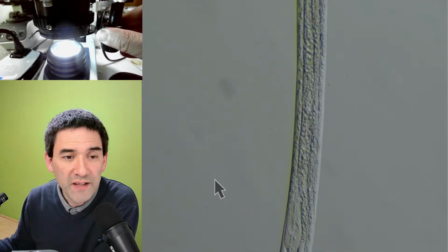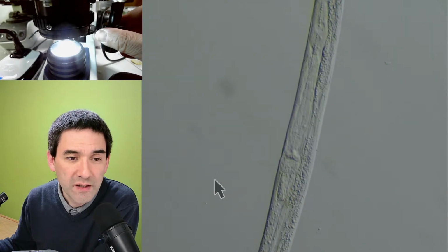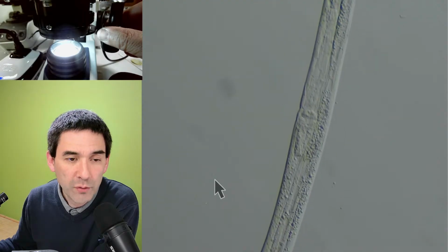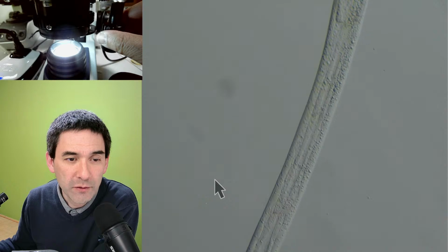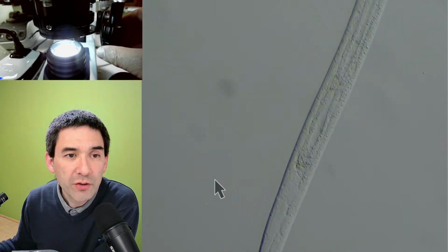These are so-called vinegar eels. The genus is called Turbatrix, and they are actually sold as fish food if you have an aquarium. You can breed them quite easily by adding a little bit of vinegar and water and sugar. Actually, this is a very nice one.